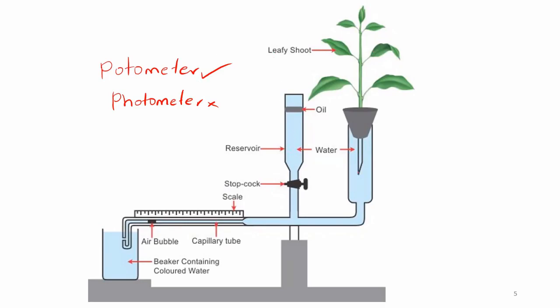In here, we have a capillary tube and two water reservoirs. First we want to submerge this setup in water to avoid air bubbles entering, because initially this setup should not have any air bubbles.